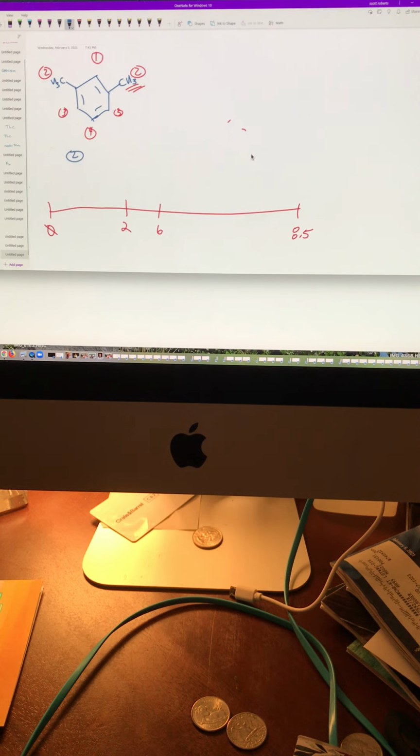Do the methyl. Mr. Methyl, how many hydrogens do you got next door? None. None plus 1. What's none plus 1? Singlet. He's lonely. He's a big one, though. How tall is she? She's 6 tall. How do you know she's 6? Because there's only a 1. You can't reduce down any further than 1, because signal 1 is going to only be 1 tall. So signal 1 is going to be tiny.